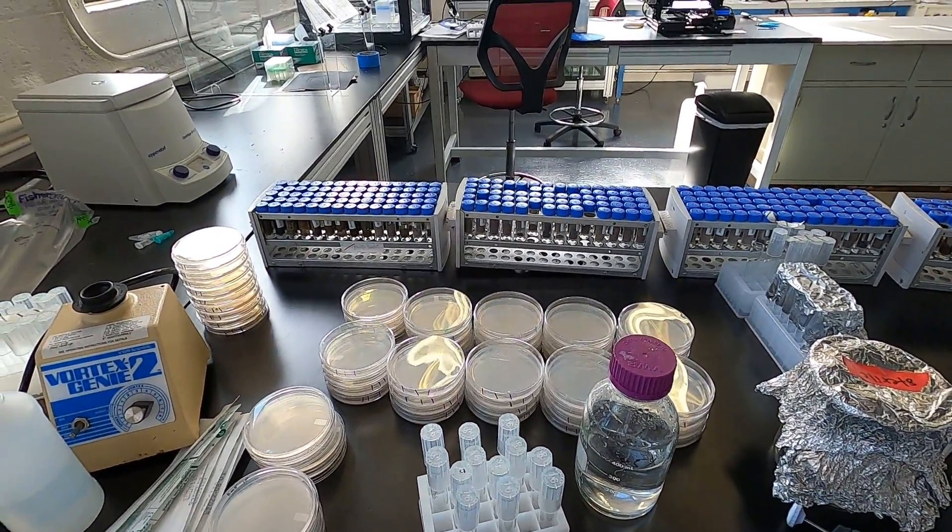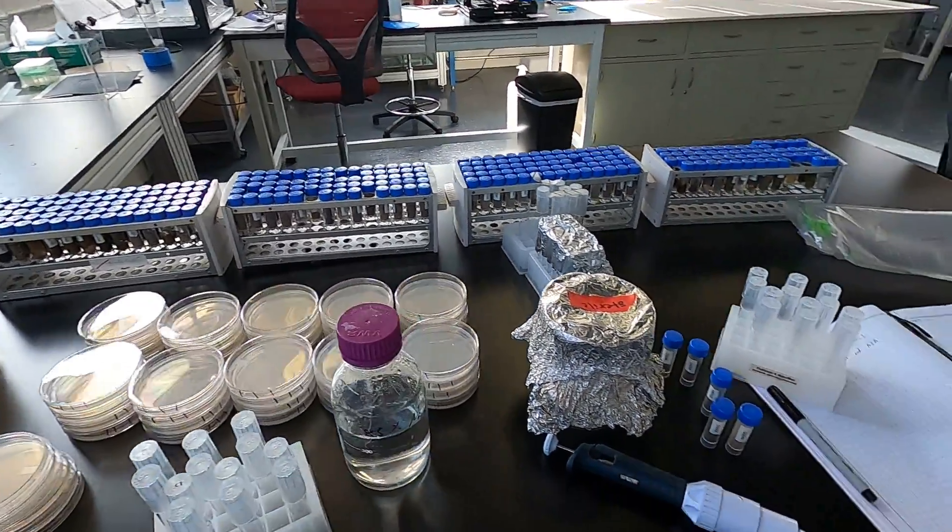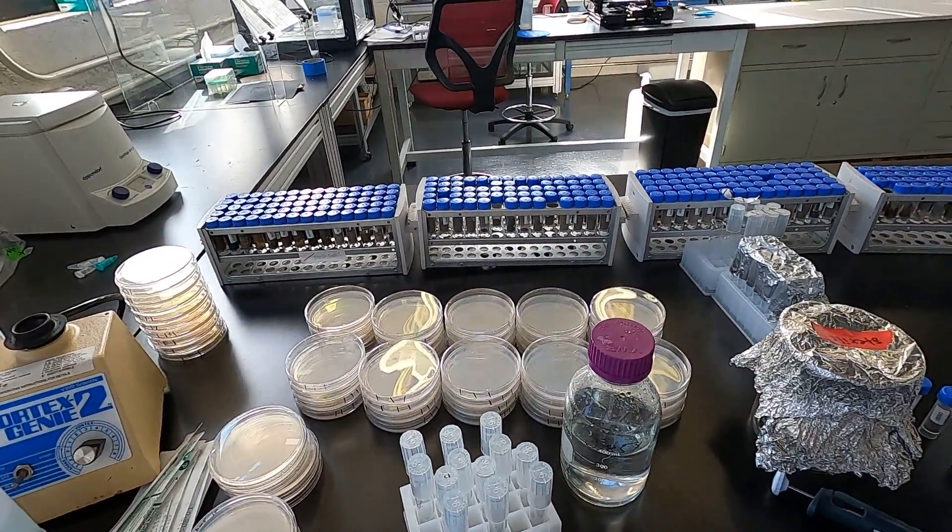Today we're going to do some serial dilutions on a soil sample. I have a number of samples to do, but I'm just going to show you how to do a set of one.